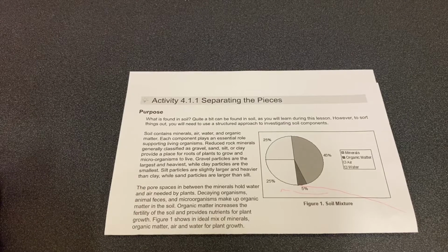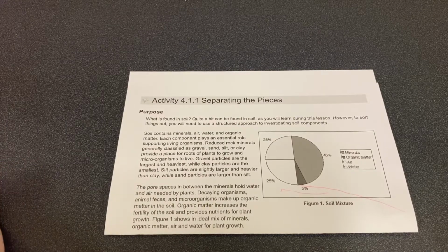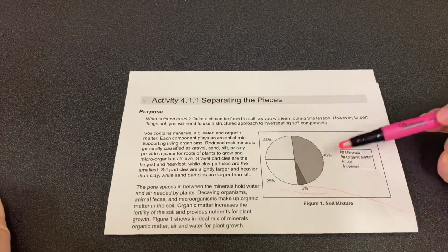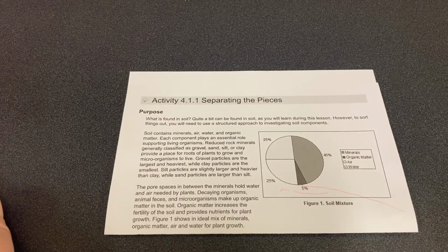All right, you guys, today's lab is all about soil. We're going to be testing 2 different kinds of soil. And before you watch this lab and do this activity, you need to do our notes on what's in soil. If you haven't yet seen this diagram, you have not yet done those notes. Please do those notes first and then come to this lab.